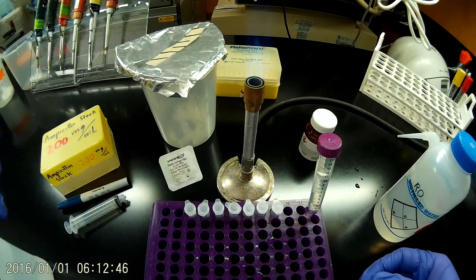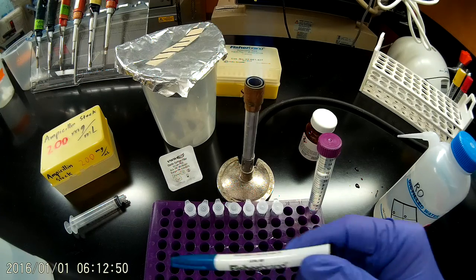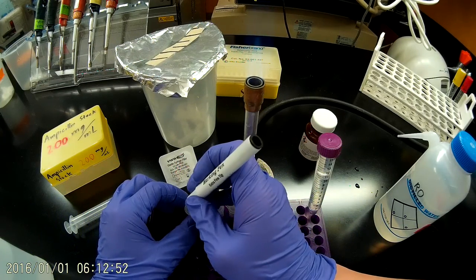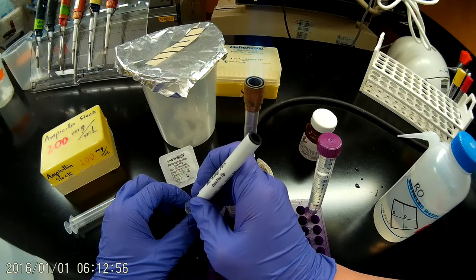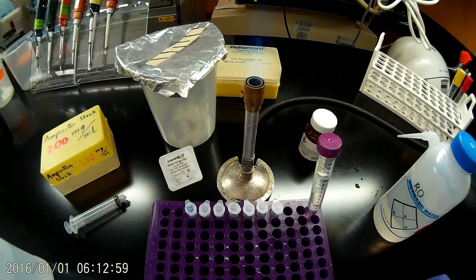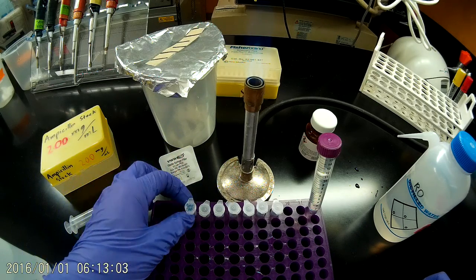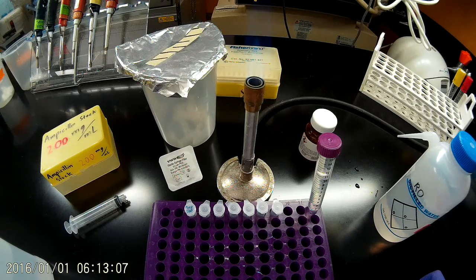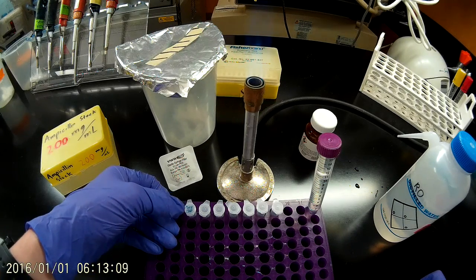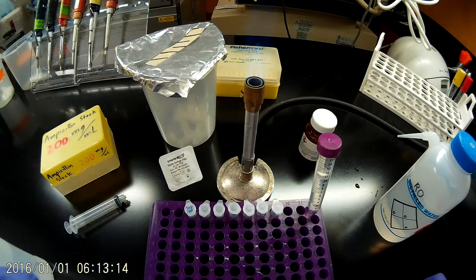When I'm finished, I'm actually going to go ahead and label all of these AMP 200. You'll actually see this notation on many of the stock solution tubes in the labs. You'll see AMP 200, AMP 100, TET 5, CAM 35, etc. This means ampicillin 200 milligrams per milliliter. We just leave off the units for brevity, but if you see that around the lab, that's what that means.